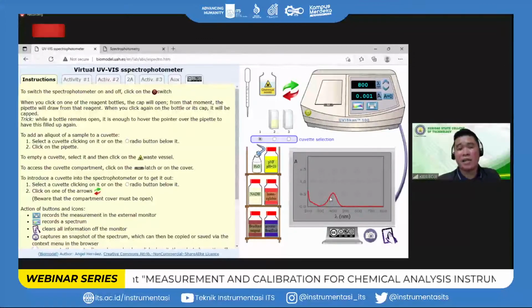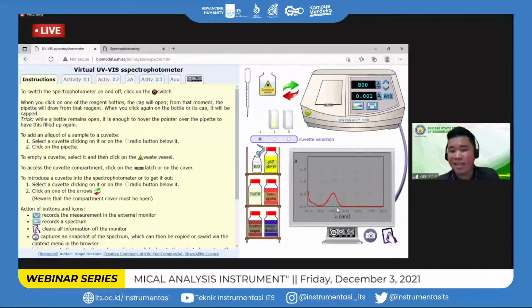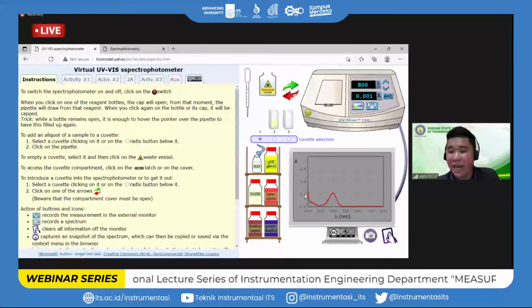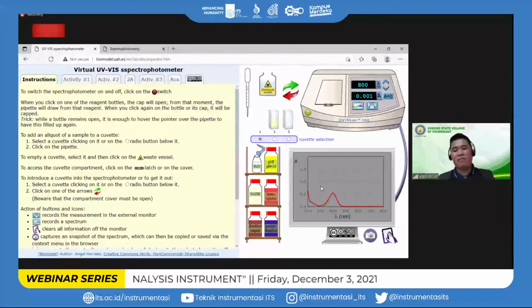The concentration of your PNF solution here is 80 micromolar. The lambda maxima of your PNF solution is at 405 nanometers at 0.5 something absorbance. That is the spectral display of your first solution.